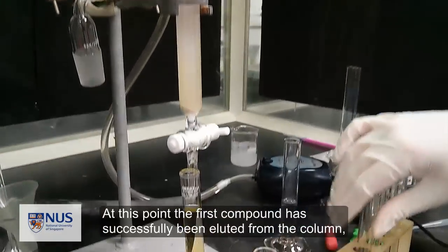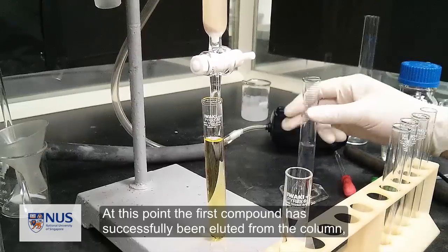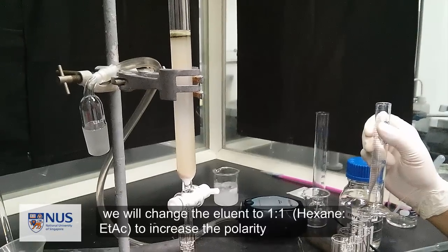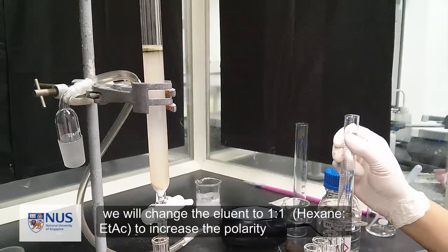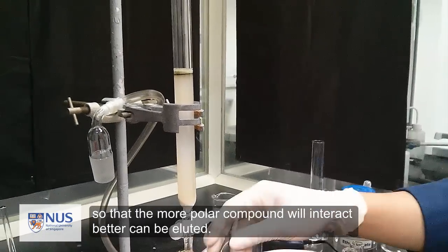At this point, the first compound has successfully been eluted from the column. We will change the eluant to a 1-to-1 hexane to ethyl acetate ratio to increase the polarity, so that the more polar compound will interact better and can be eluted.